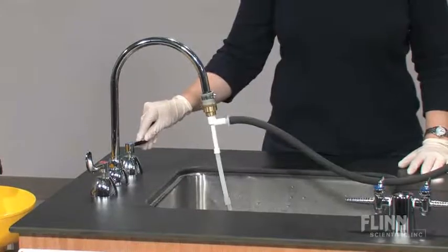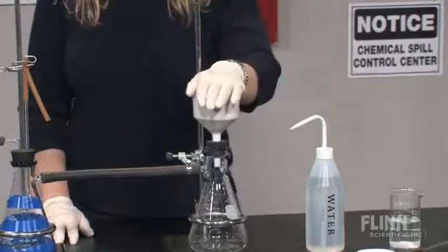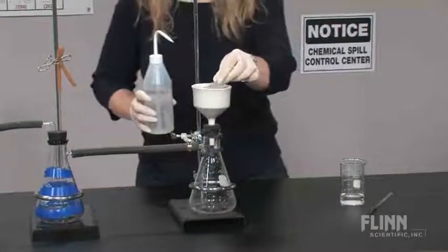Always make sure to check that the filter assembly is working correctly before use by turning on the water. To position the filter paper correctly, place the filter paper in the Buchner funnel and wet the paper using the same solvent that is in the mixture being filtered.